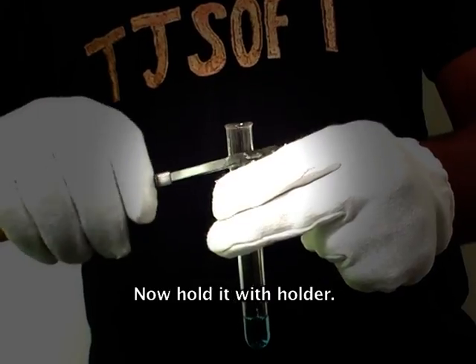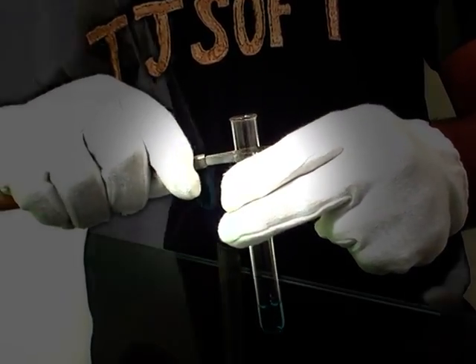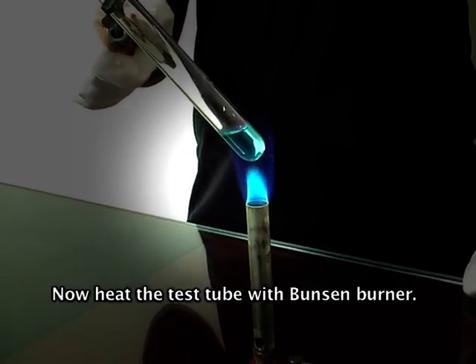Now hold the test tube with a holder and heat it with a Bunsen burner.